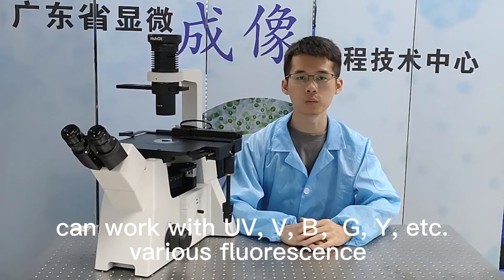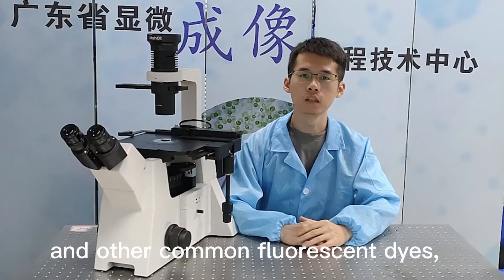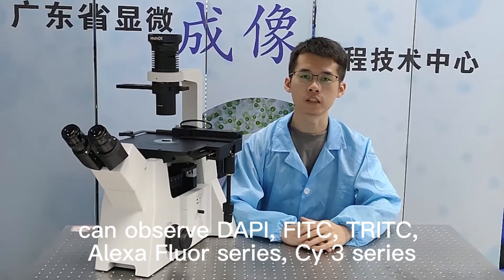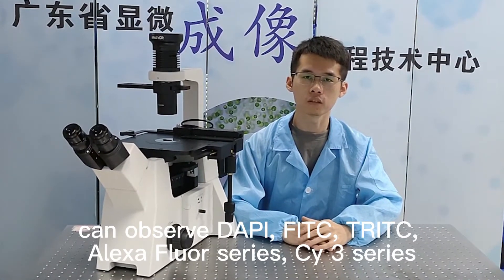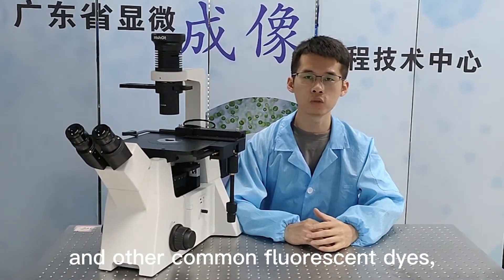It can work with UV, V, B, G, Y, and various other fluorescence types and common fluorescent dyes. It can observe DAPI, FITC, TRITC, Alexa Fluor Series, CY3 Series, and other common fluorescent dyes.